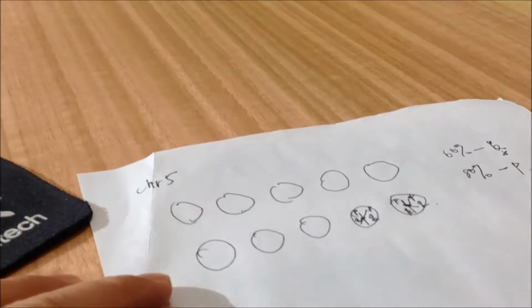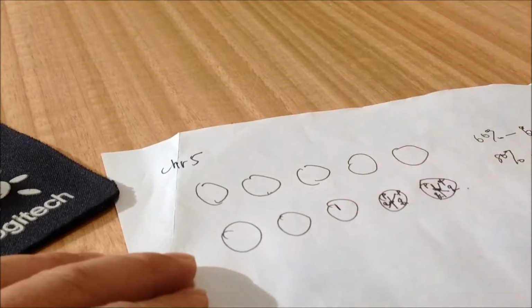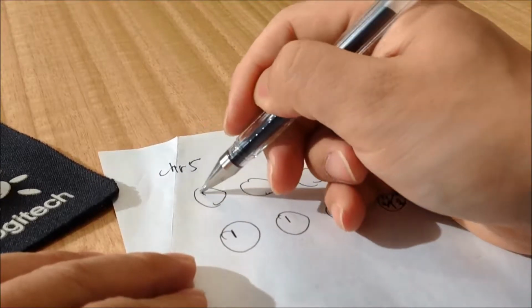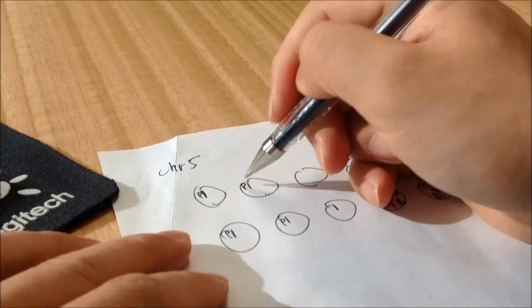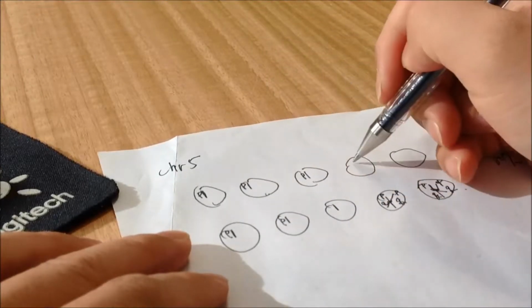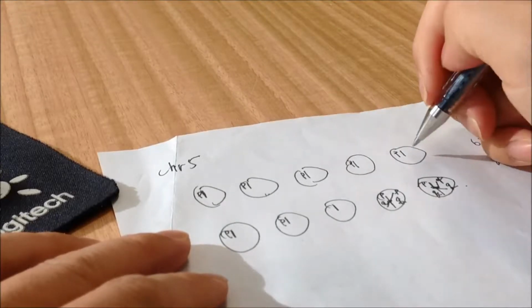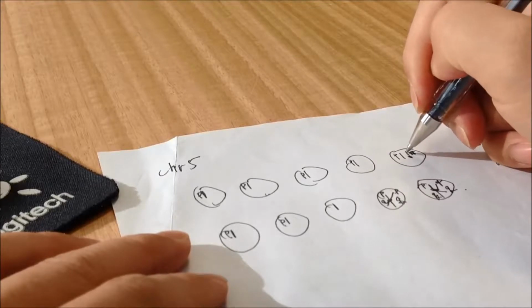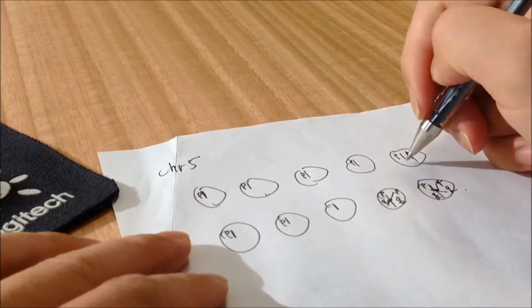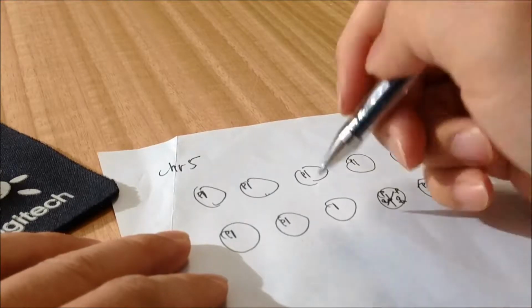And then 80% of them lost one copy of P but still have both copies of Q. Can do like this.